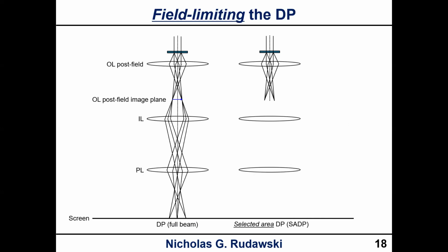Then the other twist on this is that we also have the ability to field limit the diffraction pattern.